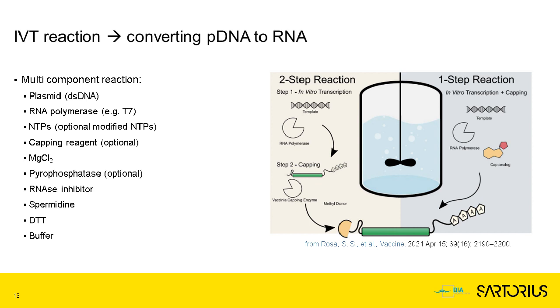It's a multi-component reaction. So how do we go about optimizing this and not get lost in the optimization? Well, there are nice publications describing DOE approaches, and they quote something like 8,000 possible combinations of all these factors. So it's too much to handle in a single-factor-at-a-time approach.